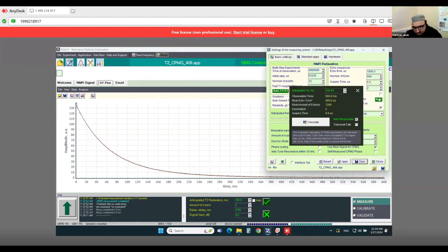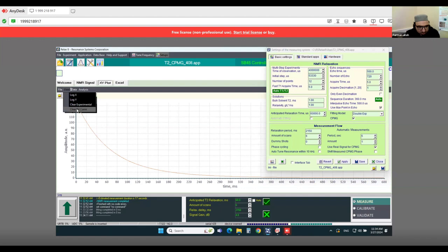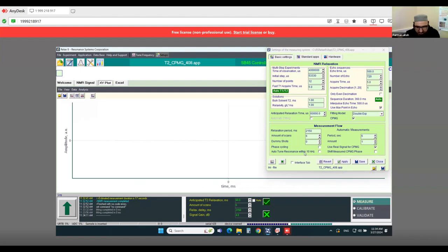Okay, let's go again to the auto, and where I will reduce this. I want around... see it starts from here, so I need... let's see it at this angle, what is happening. If you want to remove your previous, you will clear that thing from here.